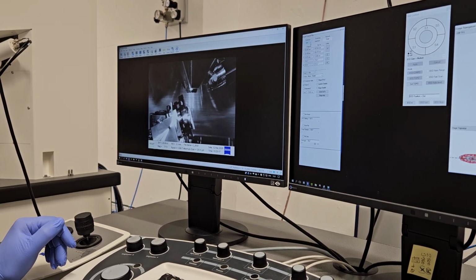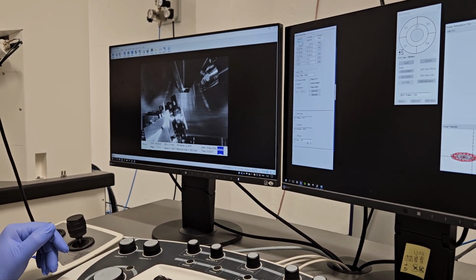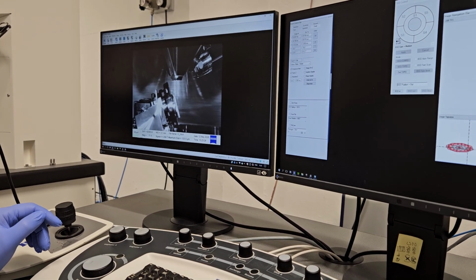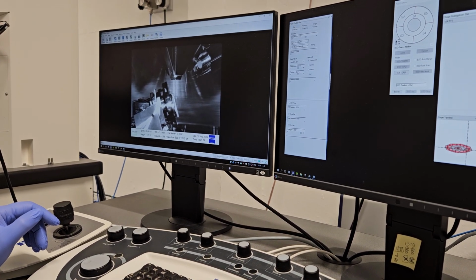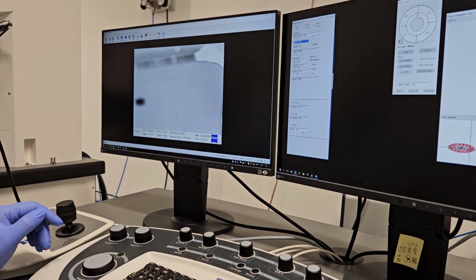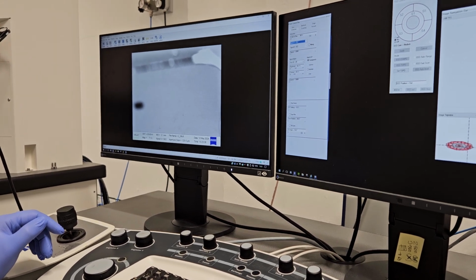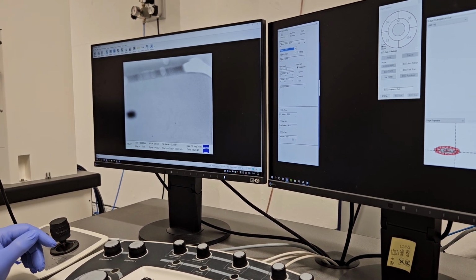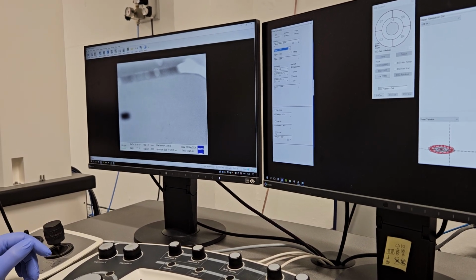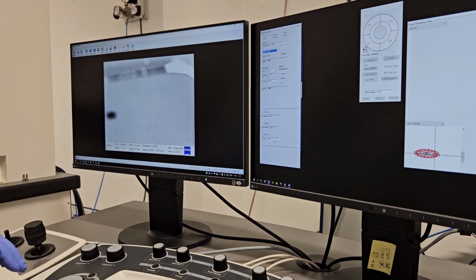And how do you know that distance? It was written in the manual. How do I know that this is 8.5? This shows you the working distance. We go to the image mode, and here you can see the working distance. But then when you focus, it will change, right? And then it should be 8 approximately. When the image is in focus, the ideal working distance is 8.5.